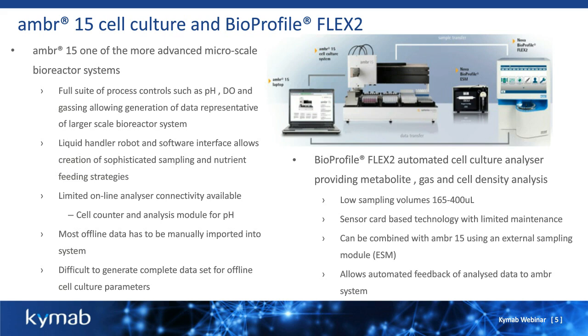It also has limited online analyzer connectivity available. For example, a cell counter can be integrated with the ambr15, and there's also an analysis module that does offline pH measurements. But most offline data, such as glucose, lactate, etc., has to be manually imported into the system. And it's quite difficult to generate a complete set of offline data.